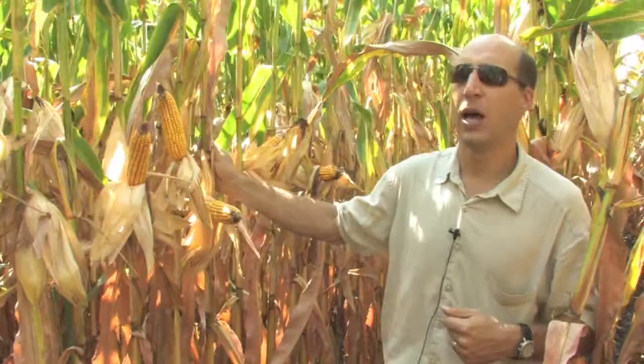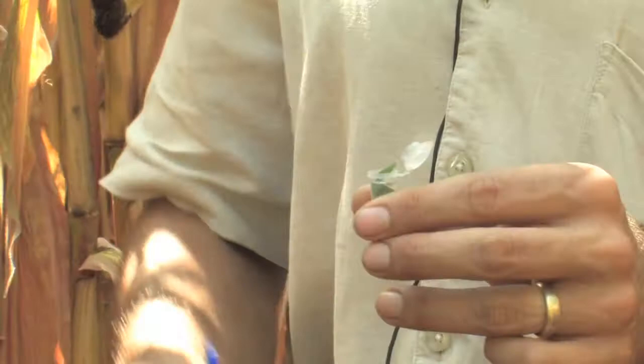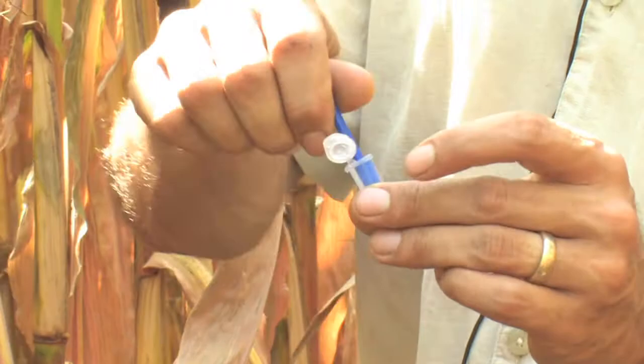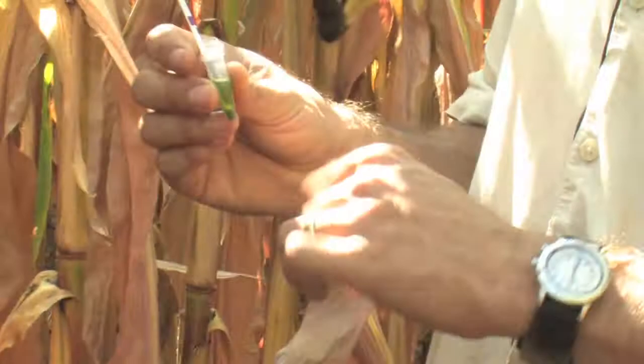To do that, I'm going to get a piece of leaf tissue, just a piece of green leaf tissue off one of the upper leaves. This is just a microcentrifuge tube with a little bit of the buffer in it. You can also use deionized water or distilled water. Crunch that leaf up, put it in the bottom of the tube, and then macerate it with something like this little blue plastic stick.